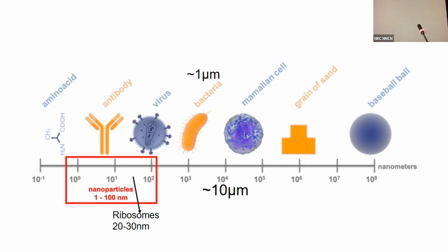If you look at the size of a mitochondria, it is around 0.5 to 1 micron. So practically speaking, you should be able to look at a mitochondria in a light microscope, isn't it? But if you see a cell, you can see those granules which represent the mitochondria, but the internal structure cannot be seen under a light microscope. That can be seen only by an electron microscope because you need to resolve the different parts of the mitochondria to say that this is a mitochondria. So that is why the electron microscope is important.